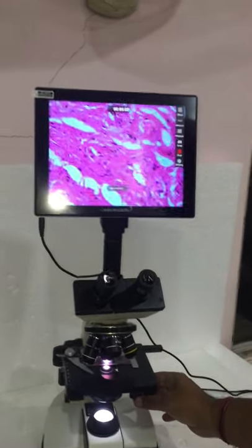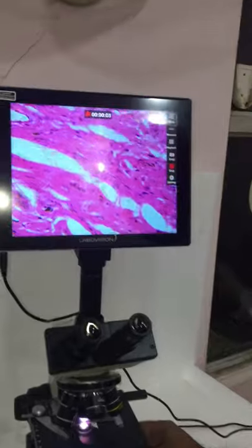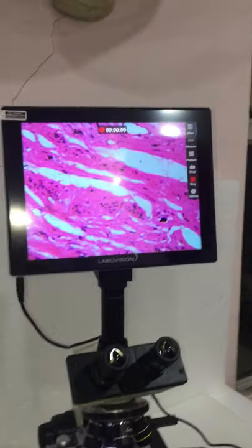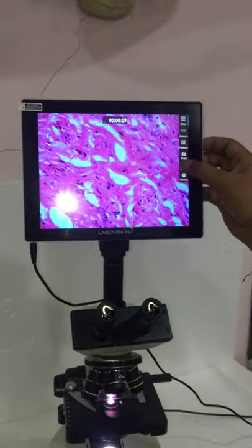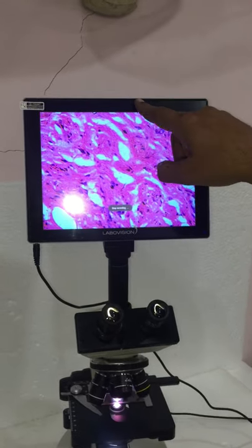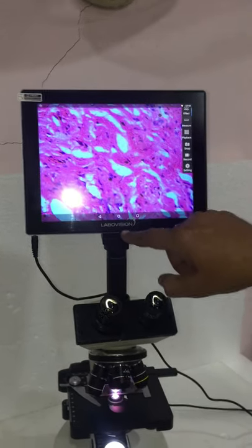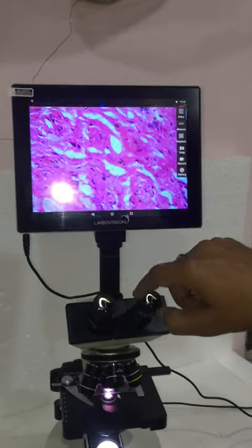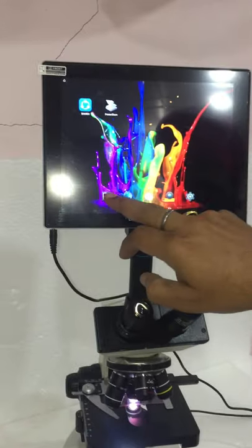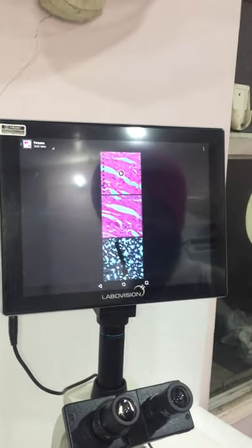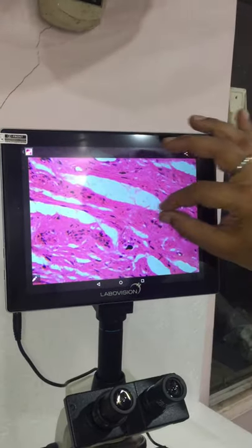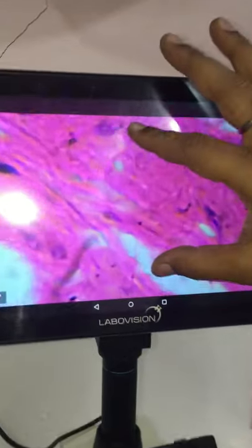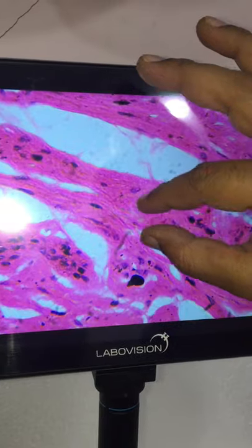This feature is very different — on this screen you can actually record data of your own while looking at the view. We'll go to the folder and see the live feed. This is the snapshot image just taken. Look at the clarity at 40X.